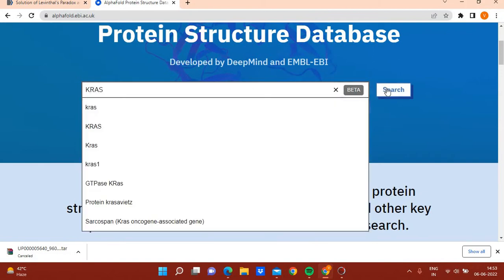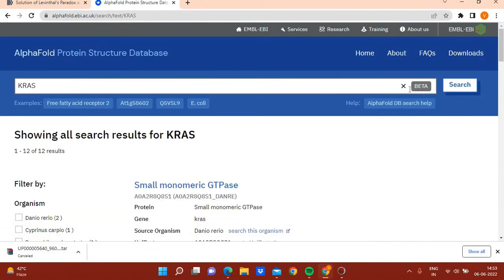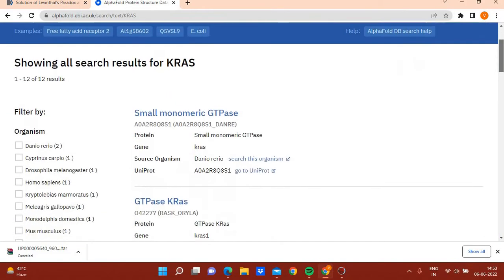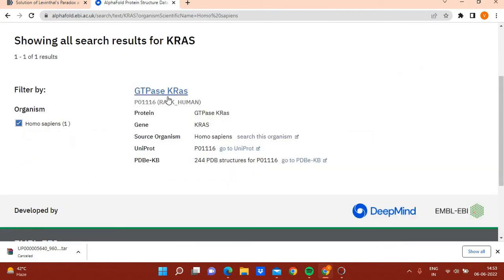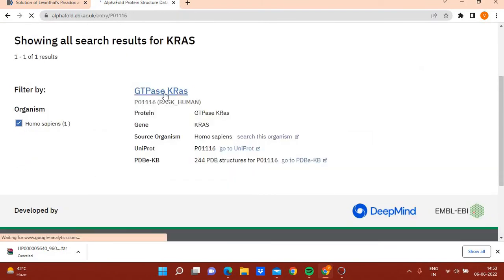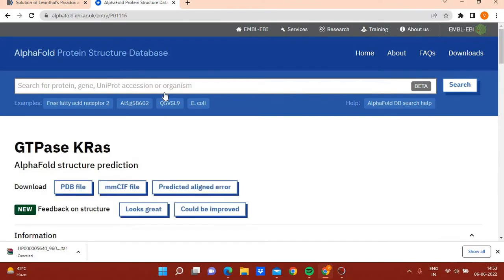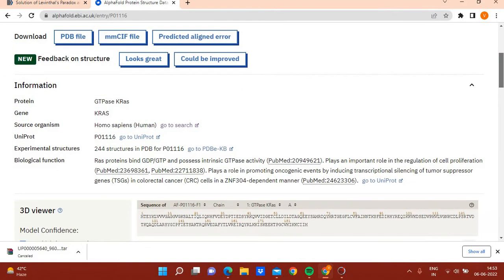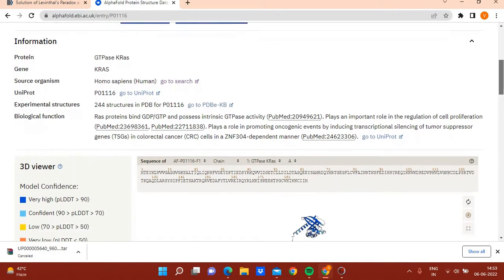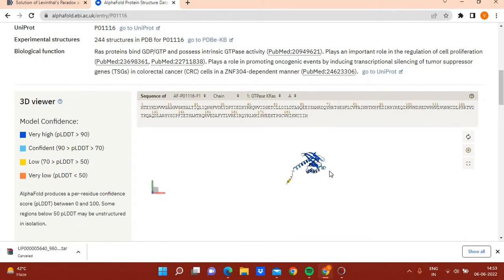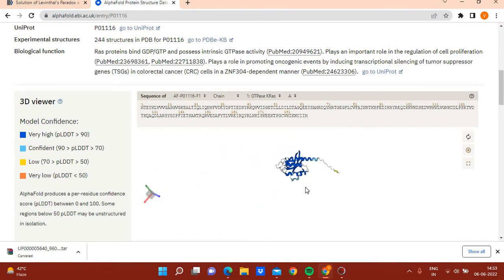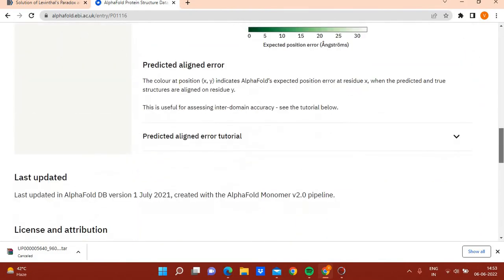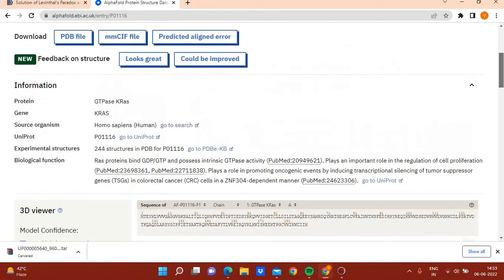Suppose you want the structure of KRAS. The crystal structure of KRAS is available, so that's not a big deal. You can select Homo sapiens and click on GTP-bound KRAS. KRAS is a monomeric GTPase involved in cancer. You can see the 3D structure here and you can download it.